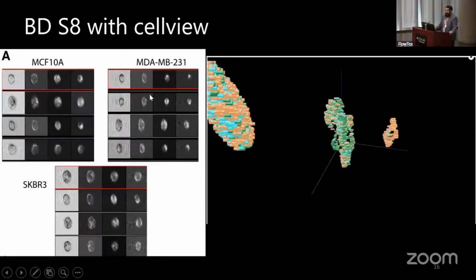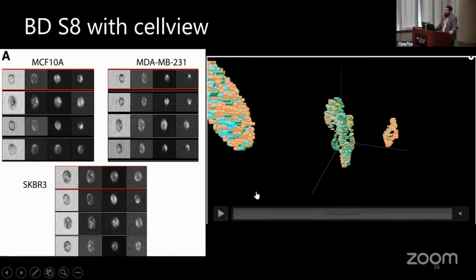But what we also want to do with these images is run it through a classification model, that's a convolutional neural net. You're going to have a piece of that, and you can then use that to project into UMAP space and see if there's classification differences.